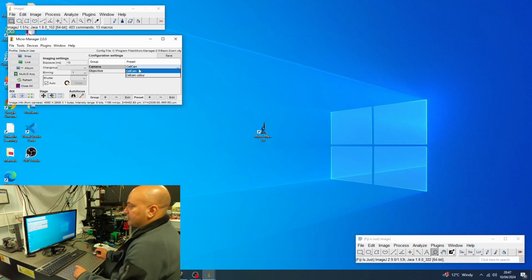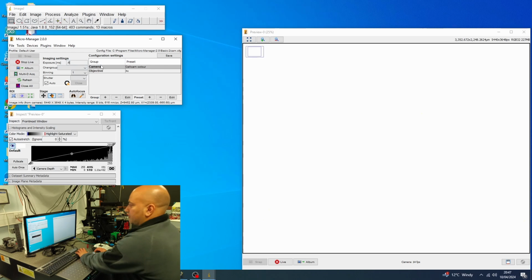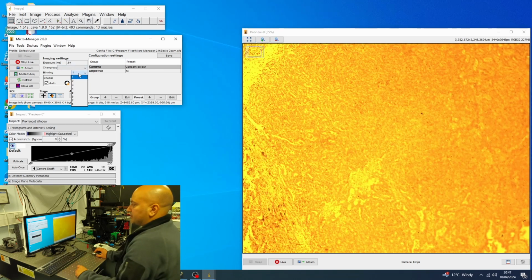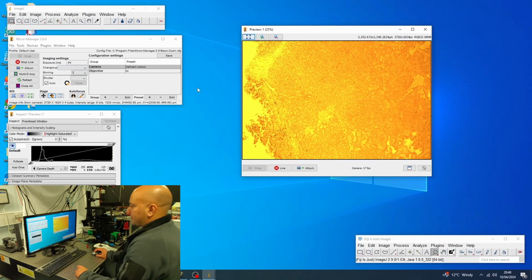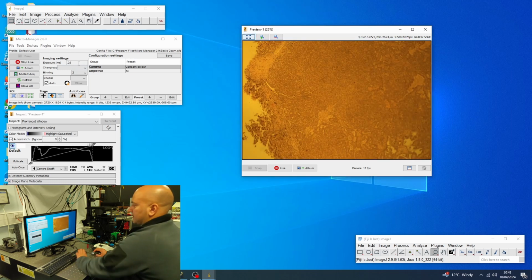It's quite large. So I'll set the color camera running. And what we can see here is that the camera is saturated. So I'll turn down the exposure time. You can see from the histogram on the left-hand side, just above the video image, that the intensity is now a bit more reasonable. I'm going to put it on a logarithmic scale, and you can see there's still some saturation at the end of the histogram. So I'm just going to reduce the integration time further until the entire histogram is visible. There we go, no saturated pixels.